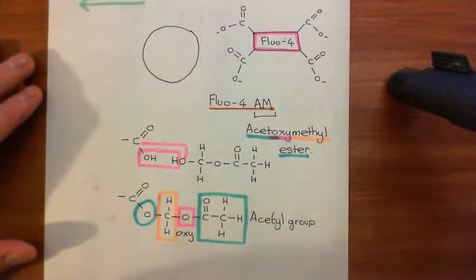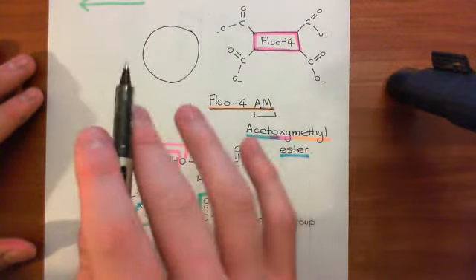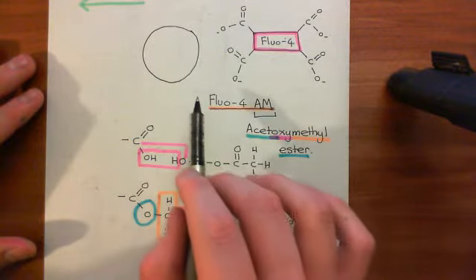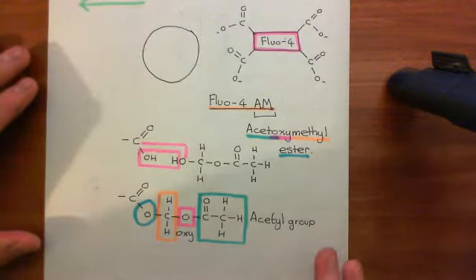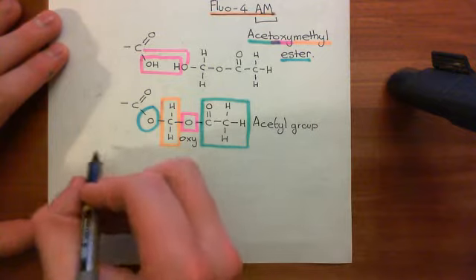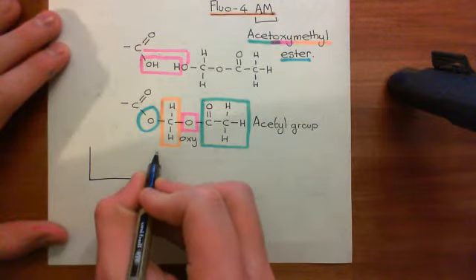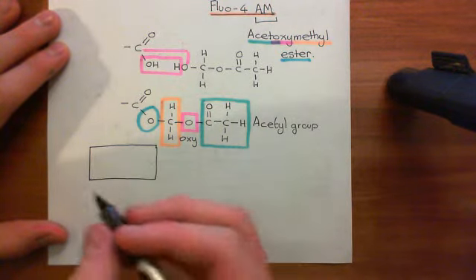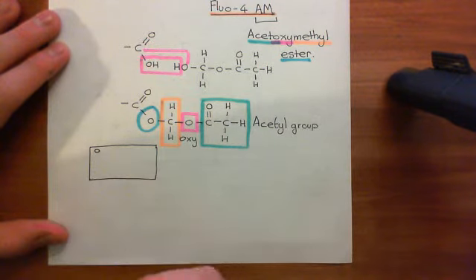Now what you can do is put the Fluo-4-AM molecules into a solution, and then you bathe your cells in this solution. Generally, when you're doing these sorts of assays, what you will be working with is a 96 well plate. Let me just draw one of these here, like so. We'll just concentrate on one well, but you will generally be doing it for a 96 well plate in some sort of high throughput assay.